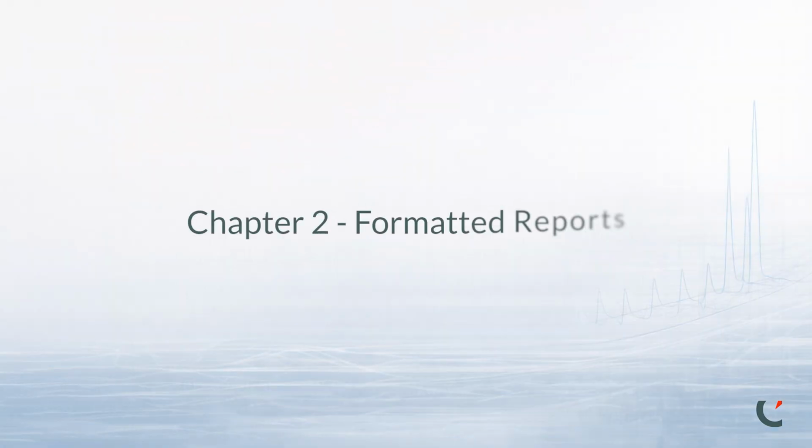We are now starting Chapter 2, Accessing, Building, and Managing Formatted Reports. In this chapter, we will focus on formatted reports, where they are located, how they are structured, and how they are created and managed within Chromperfect.